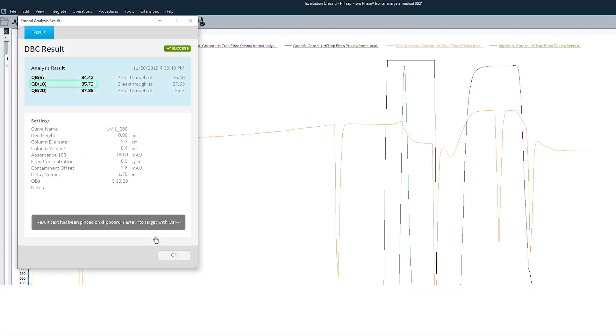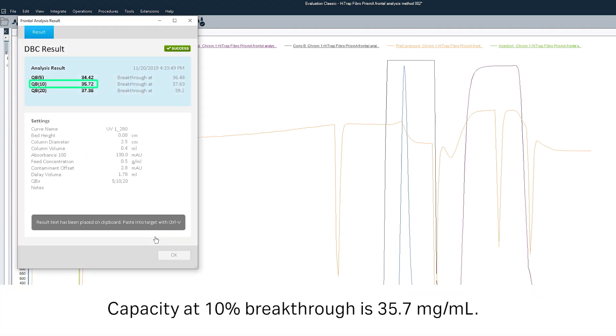Capacity at 10% breakthrough is 35.7 milligrams per milliliter.